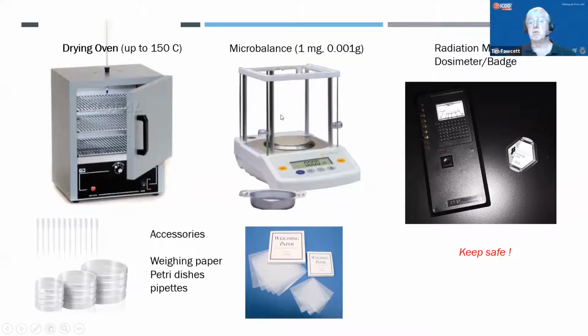This is important because usually our samples are around 200 milligrams in size. That's a generality. They can range quite a bit. Usually if you can look at the sample and see a crystal, it's at least 1 milligram. And you might want to do some quantitative analyses or standard addition examples. So having a microbalance around and some weighing paper is a good thing.